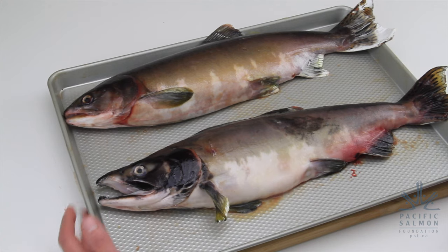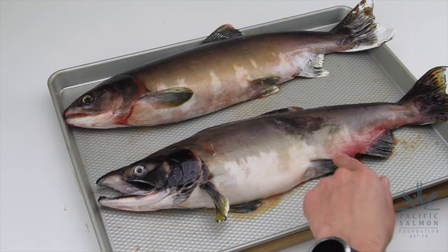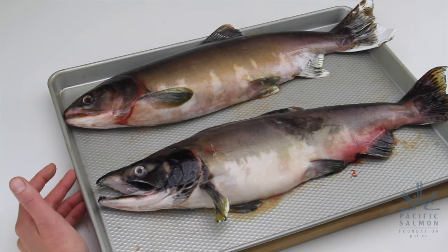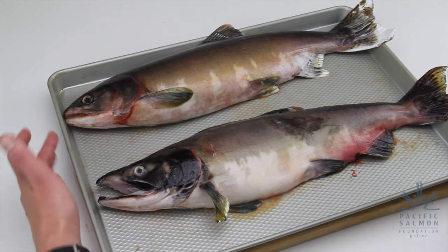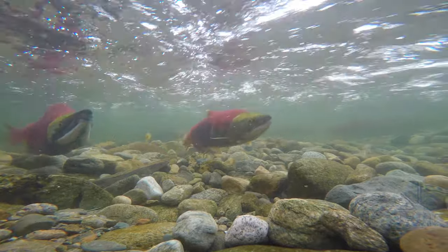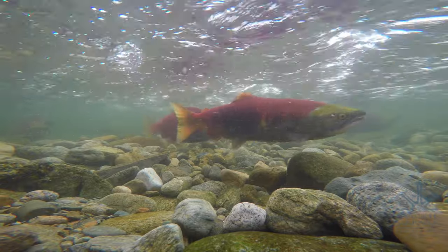We've got two different fish here. This one is a male and this one is a female, and you can see that they look a little bit different. When fish are out in the ocean they look very similar, but when they come back to spawn they start to undergo certain changes in their bodies as they get ready to spawn, and that's where you see differences between males and females.